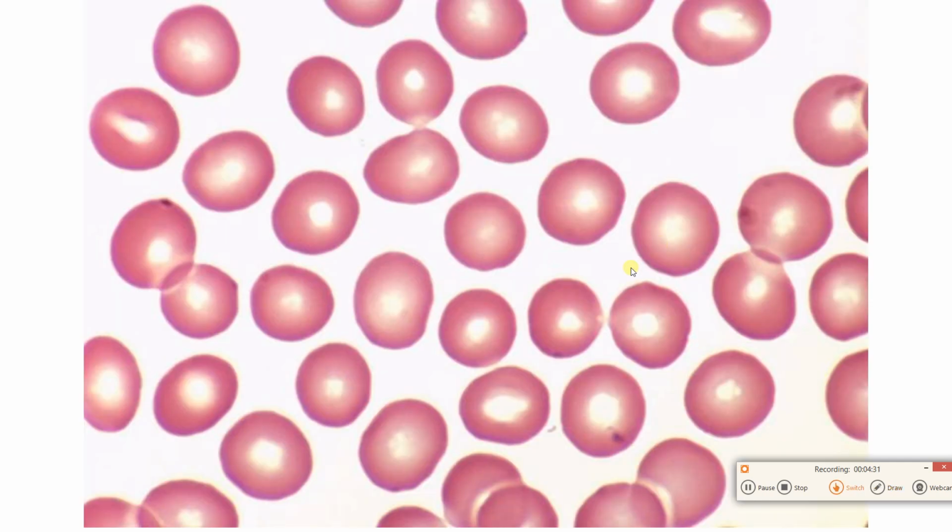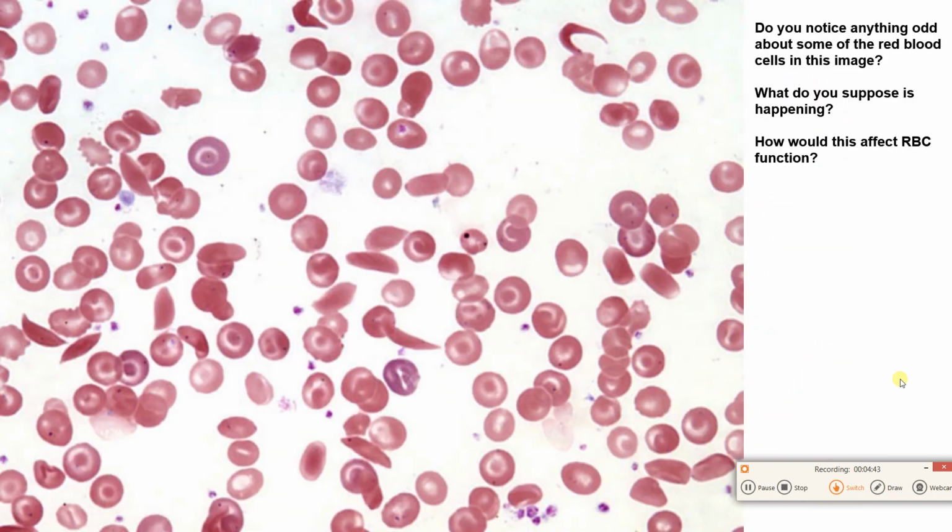All right. What do we got here? Obviously, we've got red blood cells. You can see their biconcavity as evidenced by their donut shape here. Anucleate for more hemoglobin, for more oxygen. And we got some more red blood cells here.